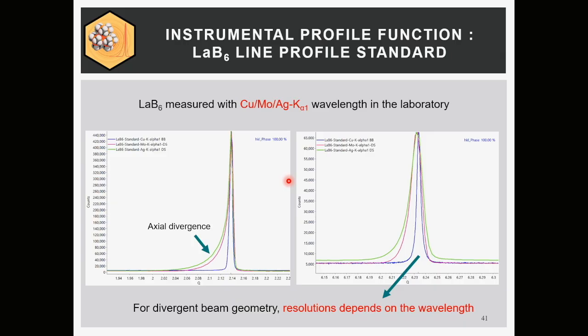So you have to find a compromise for what you're using. If you use molybdenum radiation, you have more power, more energy, and less absorption. It's great. You can use strongly absorbing materials in a capillary, but you sacrifice a little bit of the resolution.